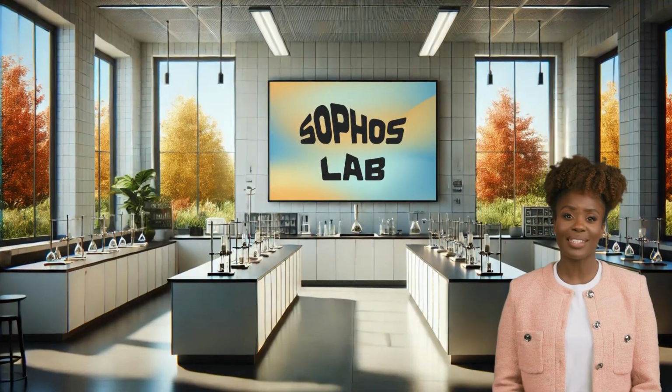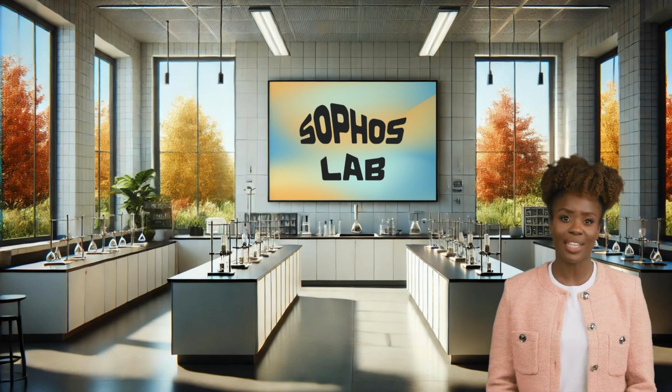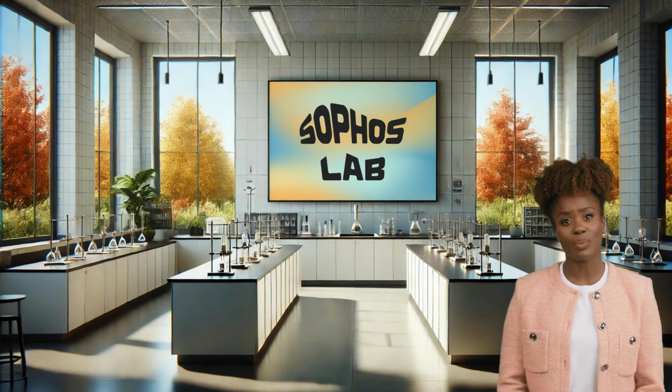Today, we're going to step into the lab and dive into a practical that will bring our study of energy changes in chemical reactions to life. But first, over to Sam, our lab technician, to outline what safety equipment we need.